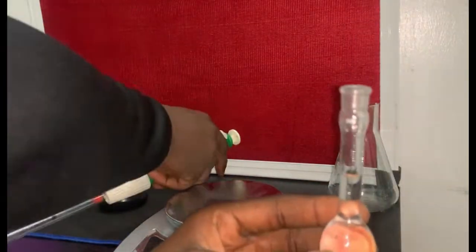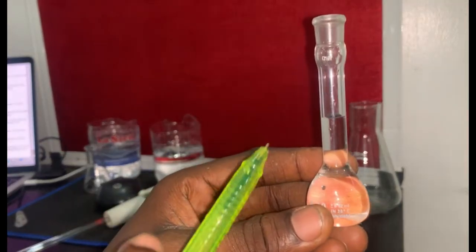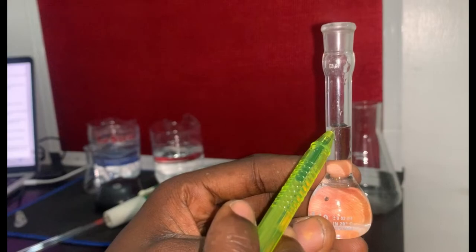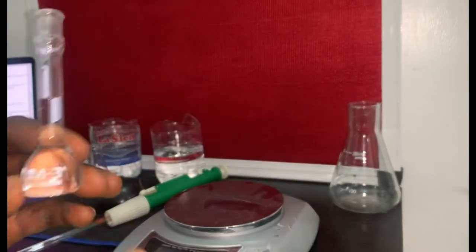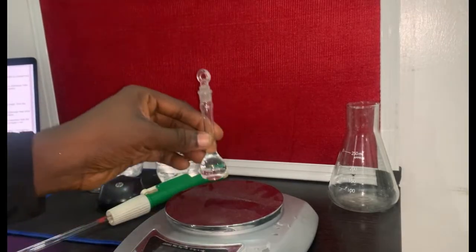All right, so if you look at this now, I filled this volumetric flask with water because from procedure 2 they said weigh it when it is empty and weigh it when it is filled with water. So I've actually filled it to the mark. This is where the line is. The meniscus cuts here. So I'll come back here. I'll cover this. I've covered it.